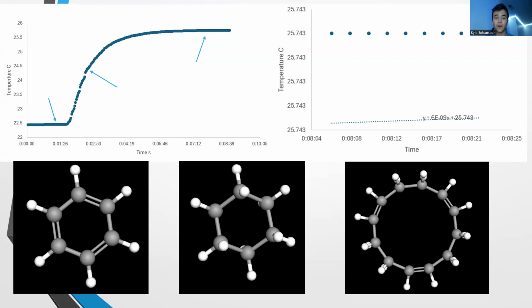The important values on the graph on the left are noted with arrows labeling points. A on the left represents time of ignition, B in the middle of the graph represents 60% of total temperature, and C reaches the maximum temperature. These values are used in the determination of the change of temperature.